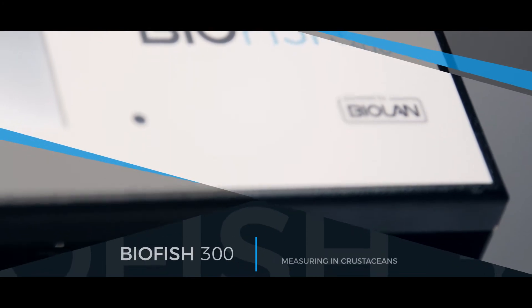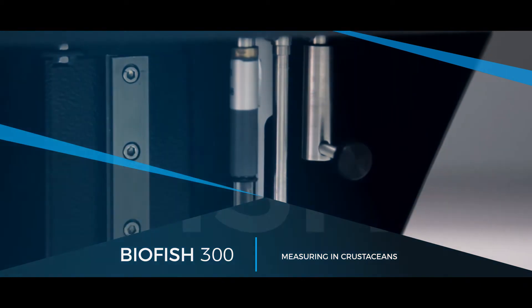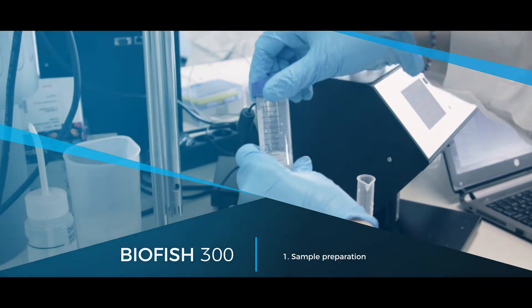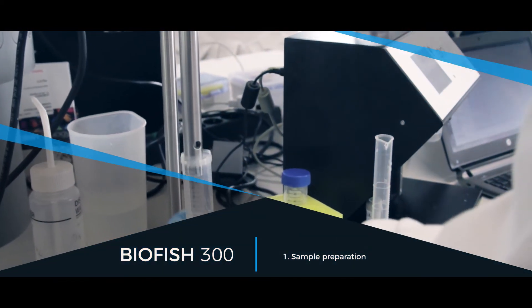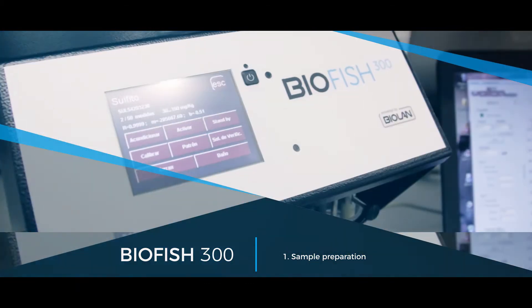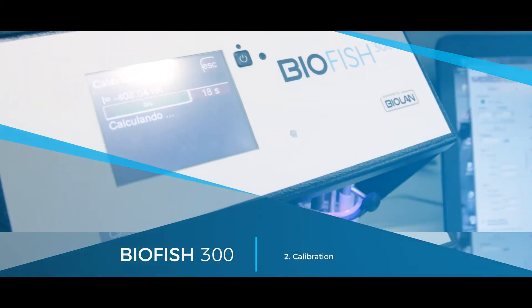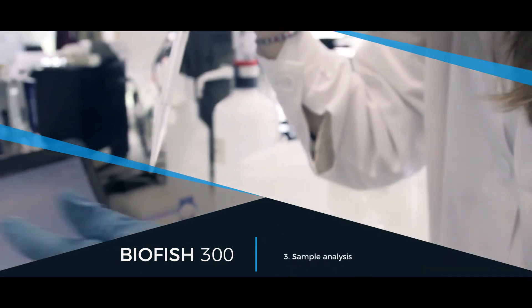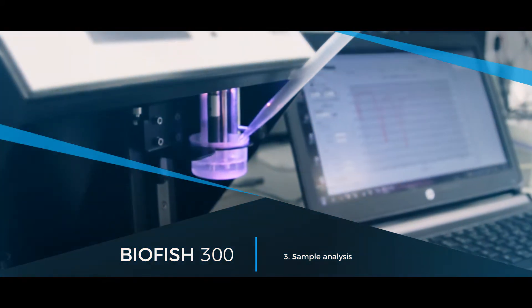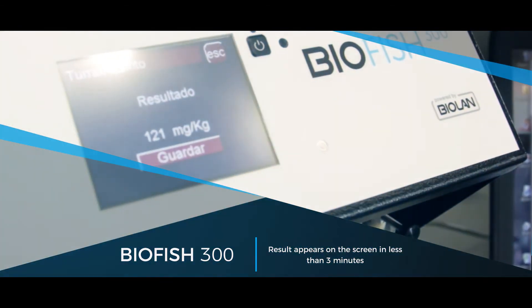For measuring the amount of sulphites in crustaceans, the following steps need to be performed: sample preparation with the help of a powerful blender, calibration — once calibrated, multiple analyses can be performed — sample analysis, and the result appears on the screen expressed in sulphite concentration units.